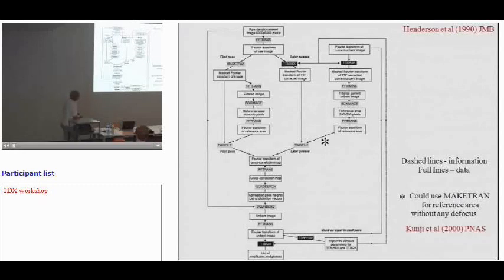So we had these programs, TT-Box, which, rather than just reading off the amplitudes and phases, which was a program called MM-Box, which was just M by M pixels, does that at the same time as it corrects the CTF. So you end up there with properly corrected amplitudes and phases that you can then just calculate a map with.